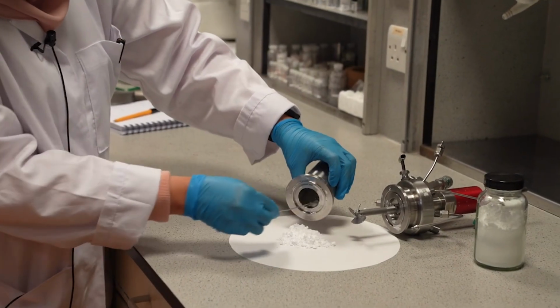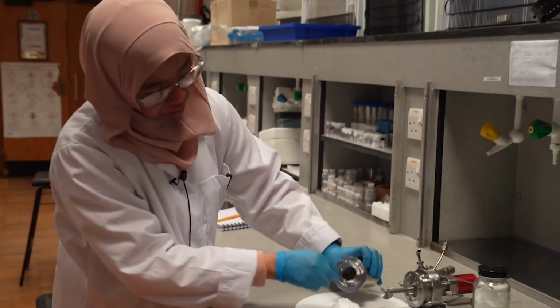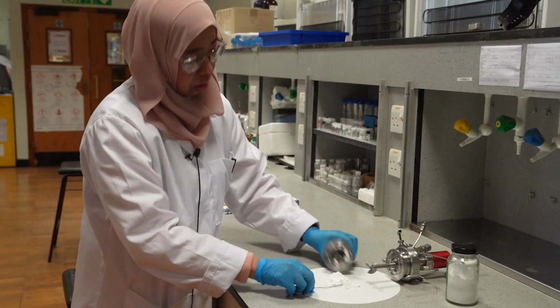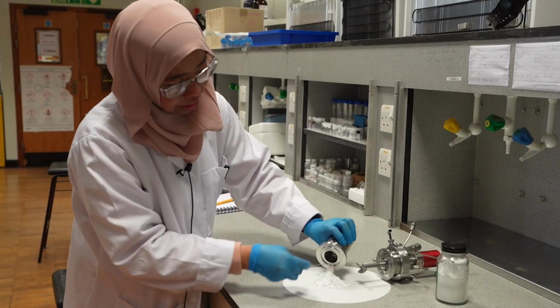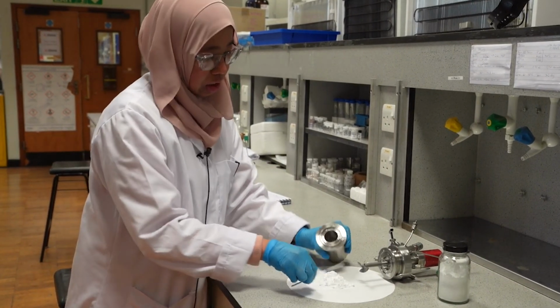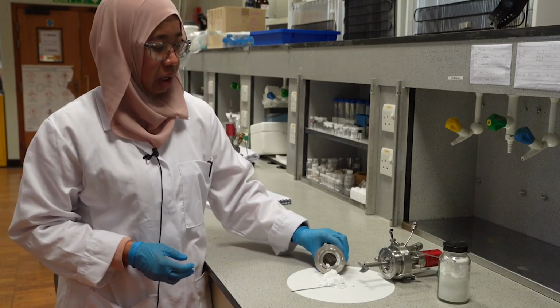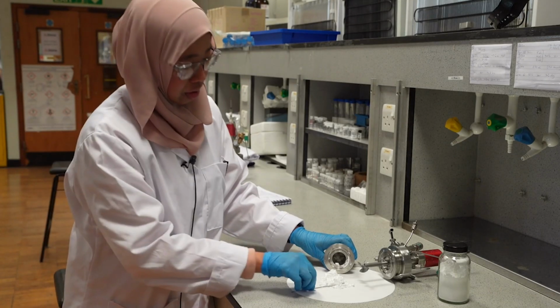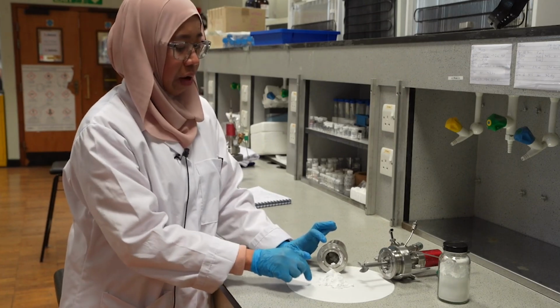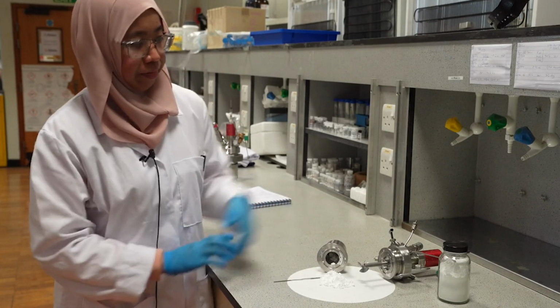Since we are doing free radical polymerization, it should turn out as a very fine powder like this. So we know that our reaction worked well. This is what we expected, a very fine, white powder.